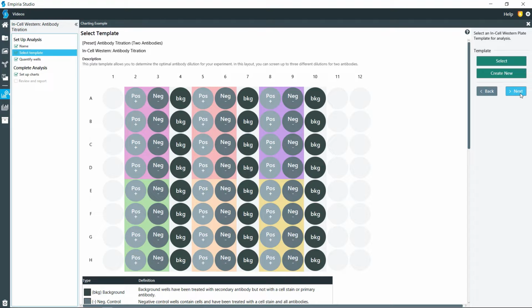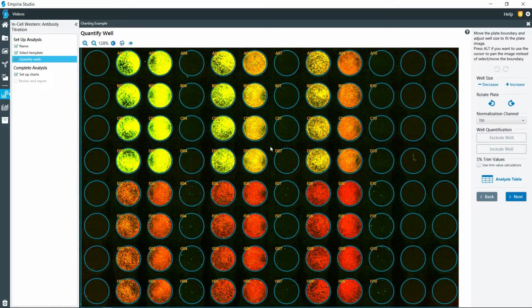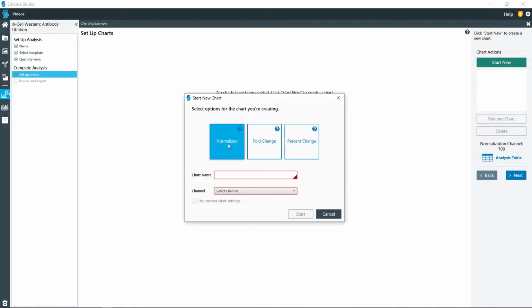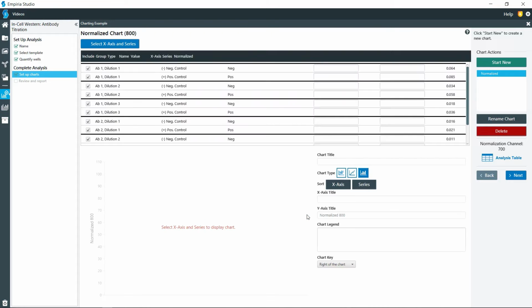And so we click over here, and all of this is shown in other videos, so if you need to, go back and look at one of those. We have the normalization channel set up as the 700 channel. And so then we come in here, and we're going to start a new chart, and I will show you examples of all three of these. And so I'm going to start with the normalized. The data are in the 800 channel, so I click that, and then start.